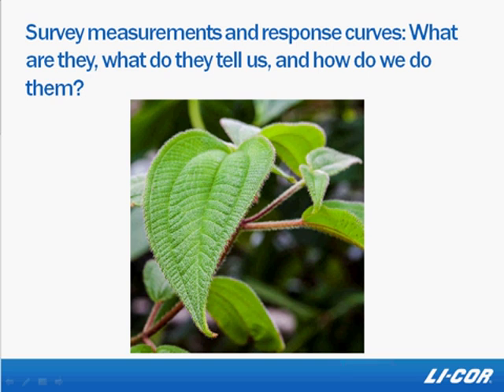Among the many things you can do to measure photochemistry are two broad categories that we're going to call survey measurements and response curves. So, what are they? What do they tell us? And how do we do them? The how is a bit more complex because it really depends on your plant and your research question, but we'll discuss the hows very broadly.